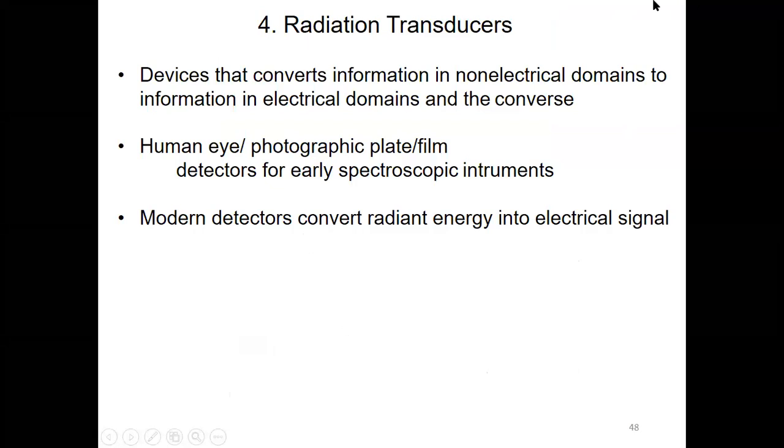Okay. Then the fourth component in spectrophotometric analysis or any optical instrument is the radiation transducer, or we can call it the detector. On the very first day, I told you I will go into detail on those transducers, printout devices and the wavelength selector, all these things. So this is another most important thing, the radiation transducer or the detectors.